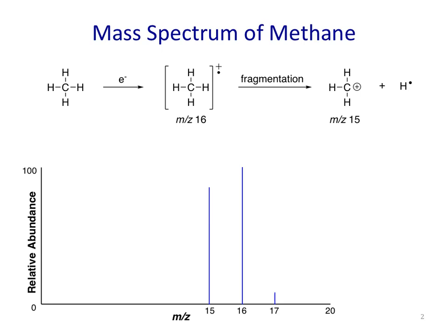To understand what's happening in a mass spectrometer, we're going to start with a very simple molecule, just methane. You put that into the instrument, it gets blasted with an electron beam, and those electrons hit it so hard that it knocks a single electron out of the methane molecule. And when we lose an electron, it then gets a positive charge.